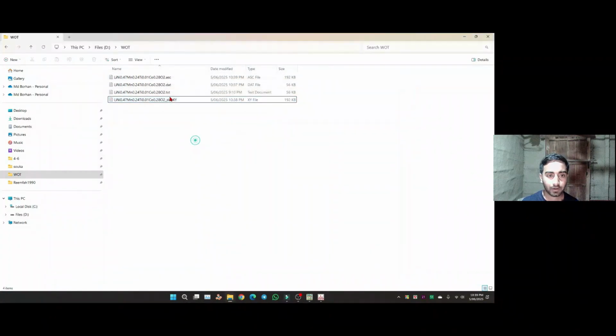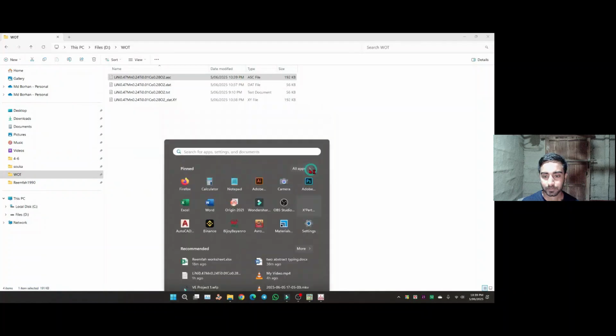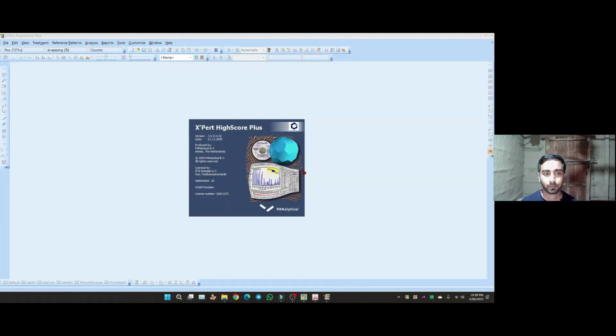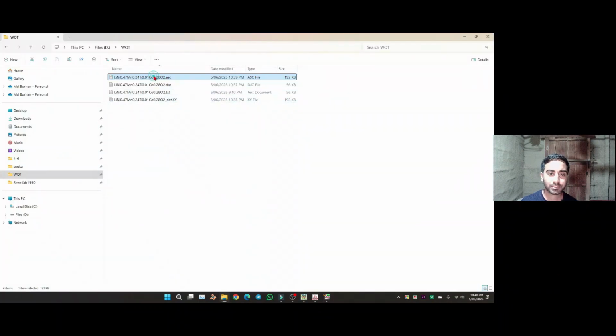Okay, our ASC file is created here. Now I am going to open X'Pert HighScore software. Okay, our X'Pert HighScore software is opened. Now I just drag and drop it in the software.